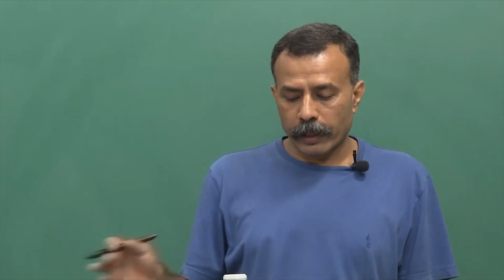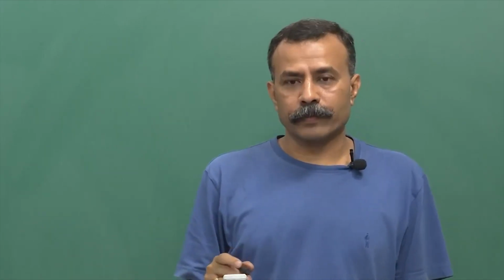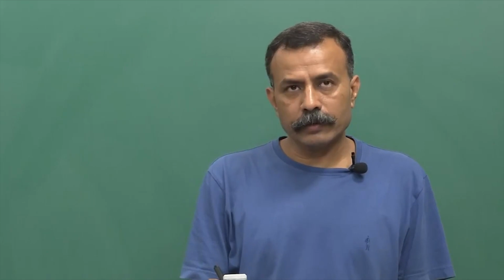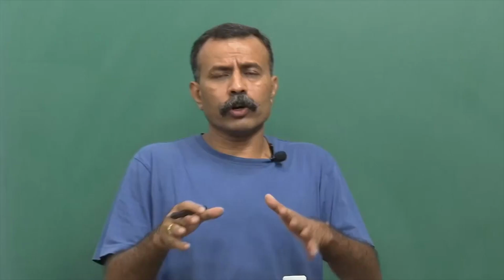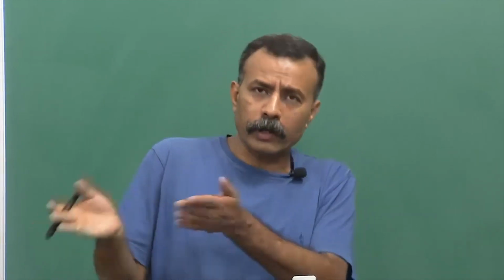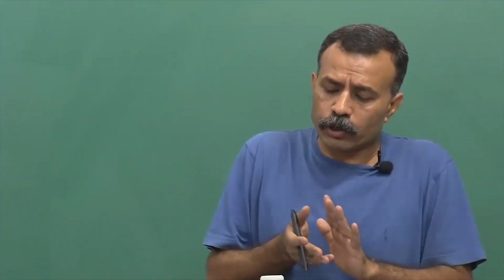So in that case, you needed to have a sink along with a water bath adjacent to it. That way you will be ensuring that you are not spilling out things. And it is always a good idea to have another sink inside. May not be a bad idea, because you are working, you want to wash your hands, you want to go to the next room, or you are coming from the next room to inside, wash your hands.